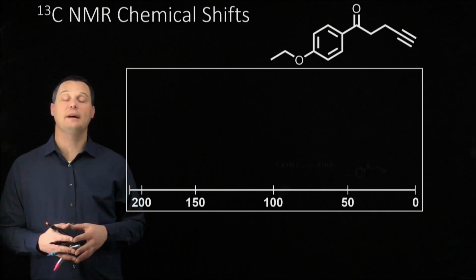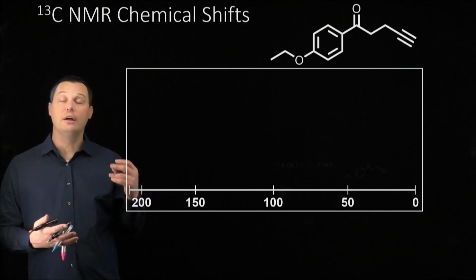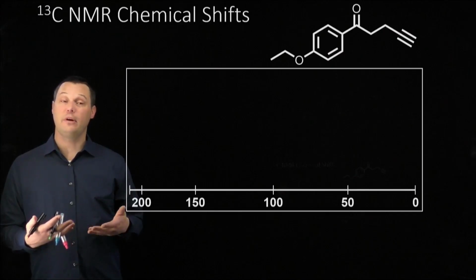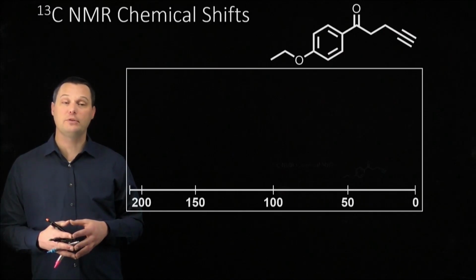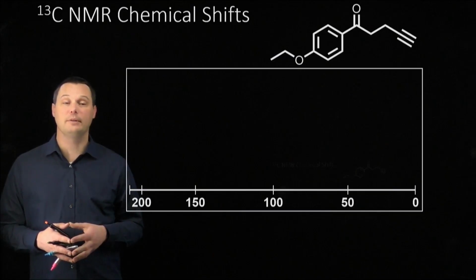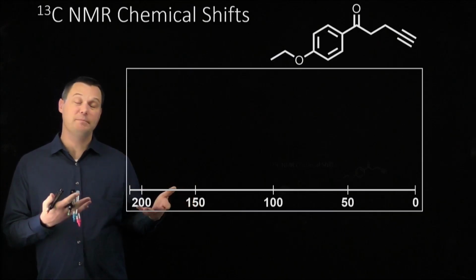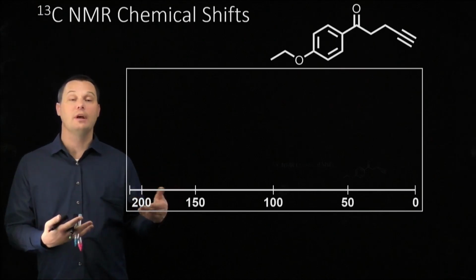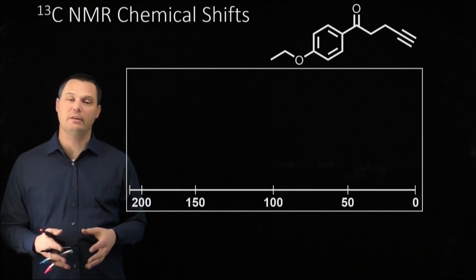When you get to spectroscopy land and you analyze your spectra, you have to know your chemical shift ranges without even really thinking about it. In a previous video, I went through the 8 chemical shift ranges for proton NMR. If you'd like a refresher on those chemical shift ranges, you can watch that video linked down below. As we go through the chemical shift ranges, this video isn't really about how carbon NMR works or how to interpret those ranges, but I do have an entire spectroscopy playlist that I'll link to down below.